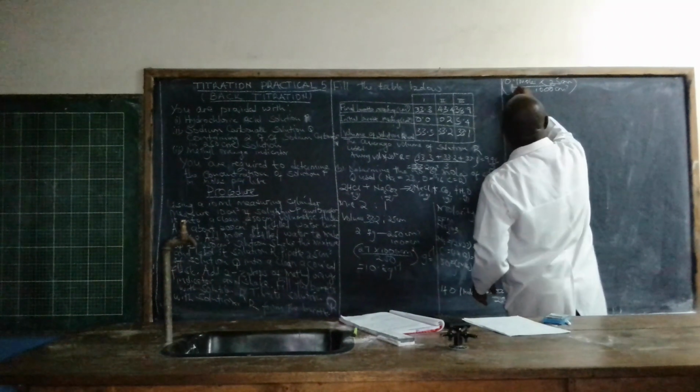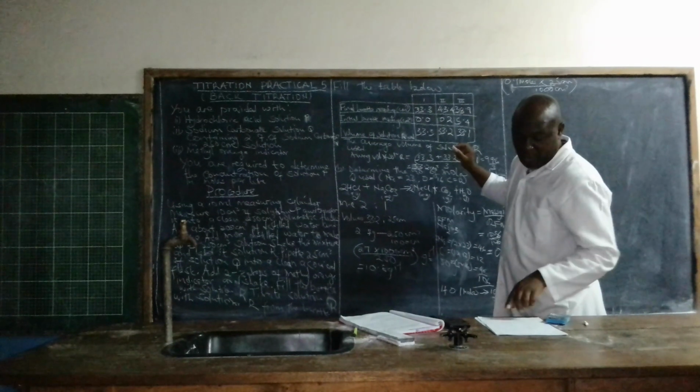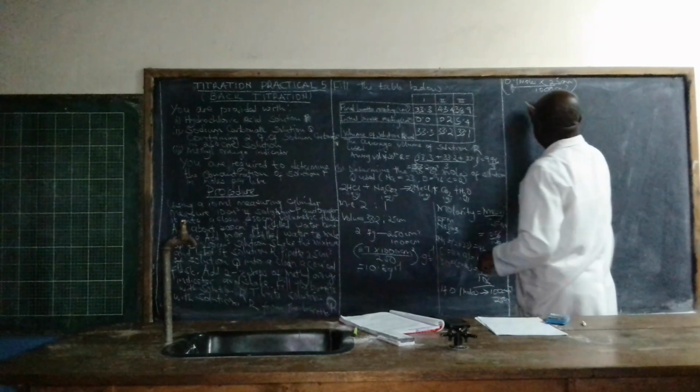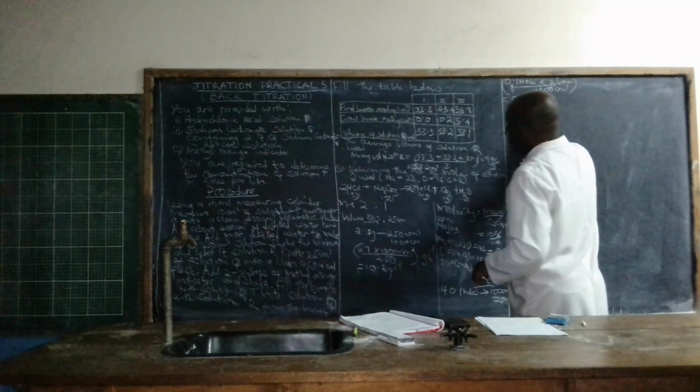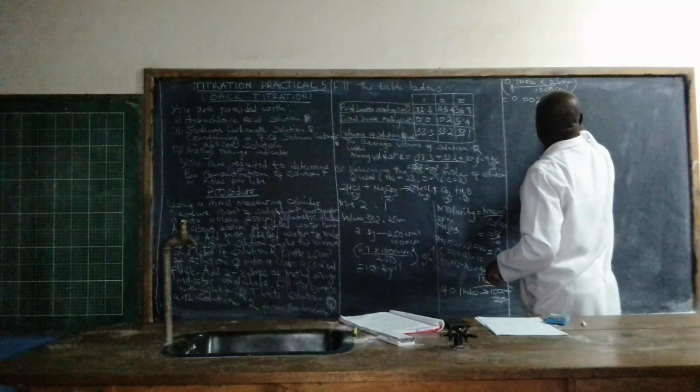If you do your mathematics clearly, you will find that the number of moles there is 0.0025 moles.